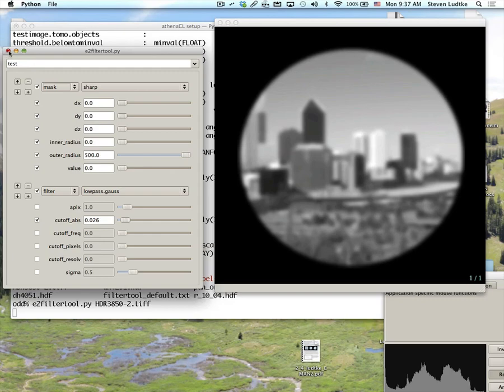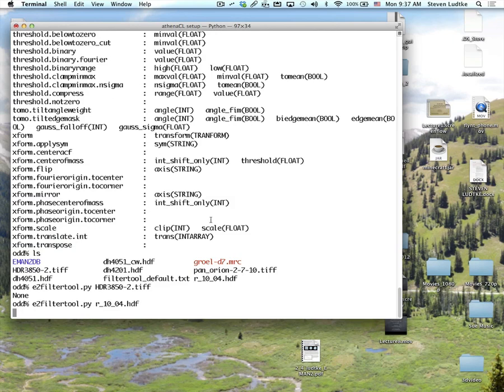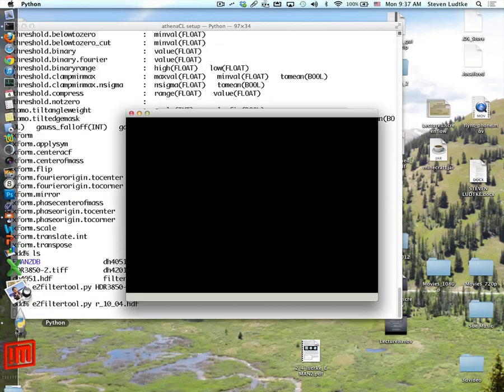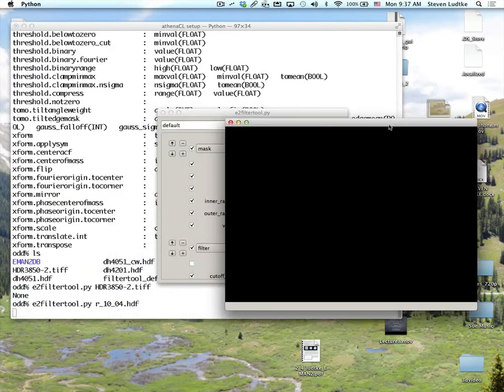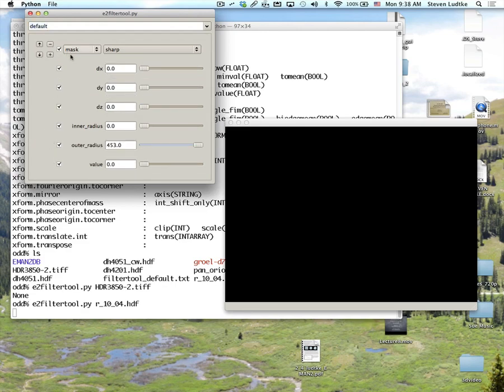As I mentioned, you could use this program on 3-dimensional data as well. I'll just do that really quickly. We'll open up our ribosome again. Oops, and like usual on the Mac, we have to click on the window to get it open. Oh, and of course, it's using the same filters that I'd set up before, so let me get rid of those.